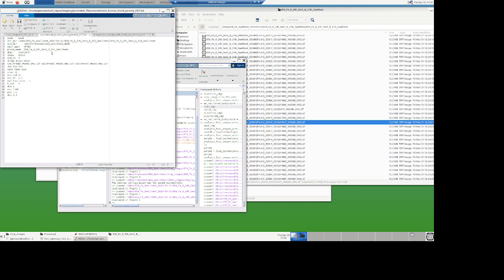That's new because the team complained about the fact that for 594 and 647, the stain that they use to identify the cells is not inside the nucleus, it's outside the nucleus. So by cropping too tight around the nucleus, we're missing most of the signal that they want to label and detect. So I'm changing this.